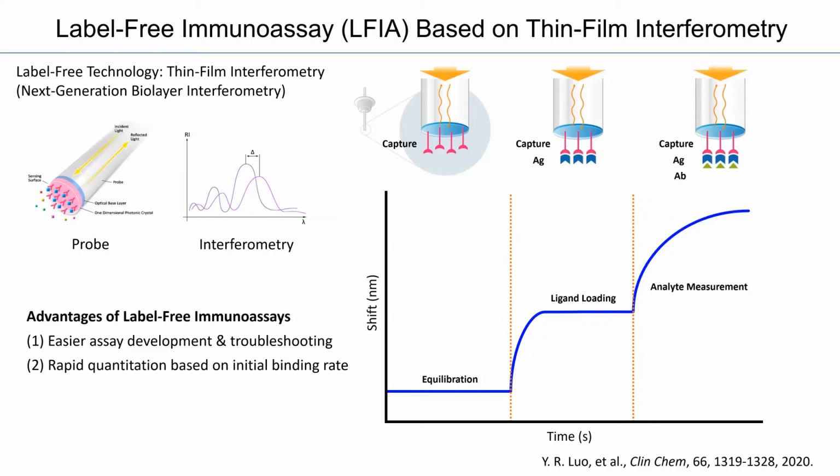So today, since for the SARS-CoV-2 assays we are not using this feature, I'm not going to explain it in detail, but I just want to mention this is a very important feature for label-free immunoassays if you want to achieve rapid analysis of your samples.